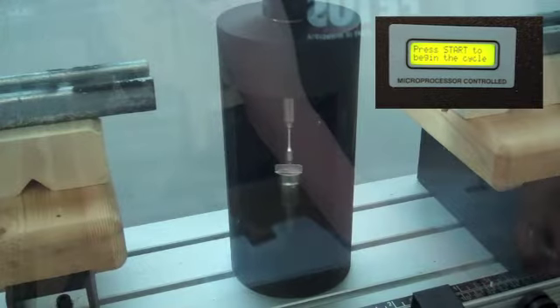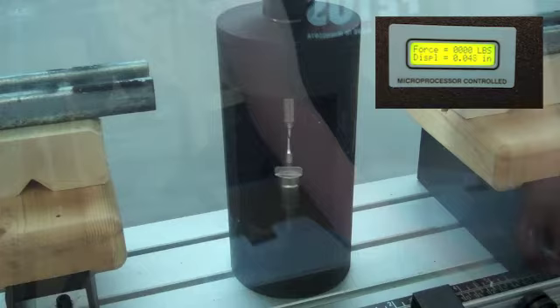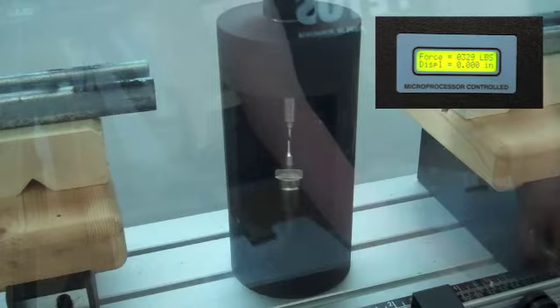In this demonstration, we have a stress test analyzer to determine the strength of different metals. First, we test aluminum. The stress test tells us that it took 238 pounds of force to break. Secondly, we test steel. Steel is composed of predominantly iron with carbon, manganese, phosphorus, sulfur, and silicon. This test shows us that it took 327 pounds to break.